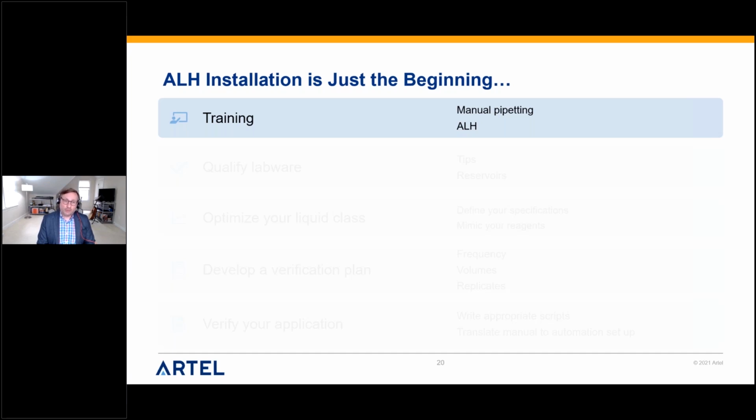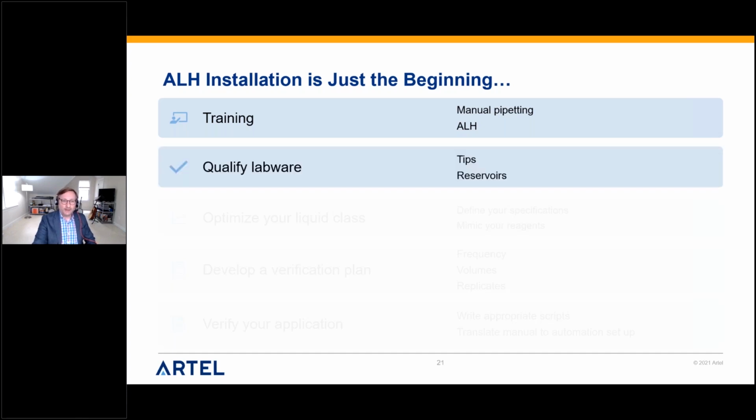And then there's manual pipetting training, and we're going to talk about that because I know some of you are thinking, Nat, this is about automated liquid handlers. I'm trying to get away from manual. Really, the whole idea here is about transitioning from manual into automated liquid handling platforms. And we're going to touch on that in a little bit here, a couple of bumps down.